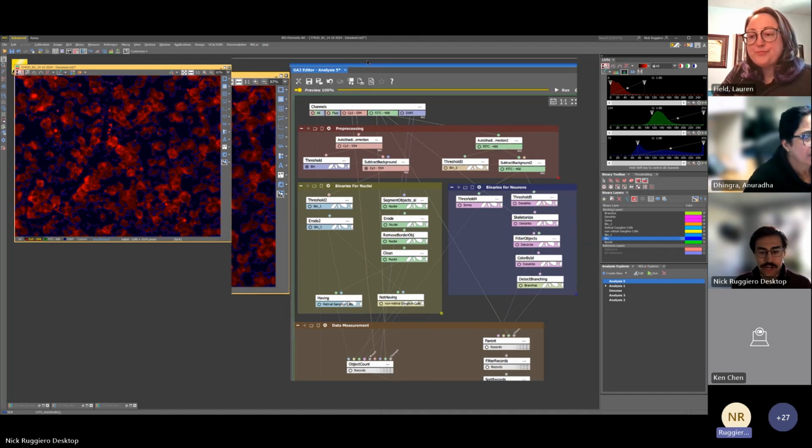So I ran a background subtraction on this. It is important to note, this is sort of like what I thought was going to work well. If you guys, who are the ones actually doing these analyses, we don't really want to make decisions for you on your science. So some things that I excluded here, you might say, no, I actually want to include that in your data. So I would go in and mess with these recipes and adjust the thresholding, things like that. Maybe try something else that you're used to doing. So this is what we thought would work well.